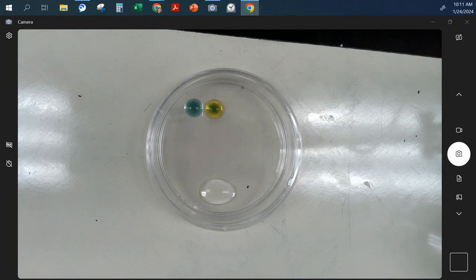Or you could change it, like, same number of drops every time, but I'm going to put the 2 clear liquids in a hot bath first. And then I'm going to put them at room temperature. And then I'm going to put them in a cold bath and see how the temperature changes the rate. Okay? Does that make sense?